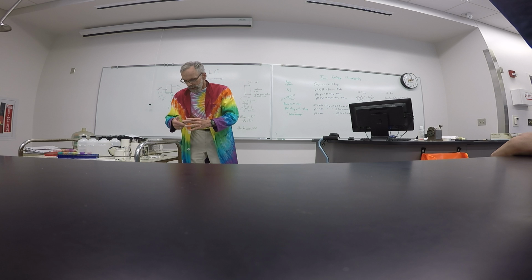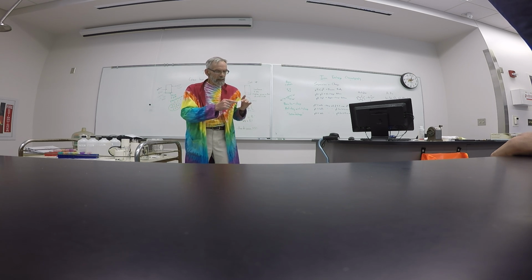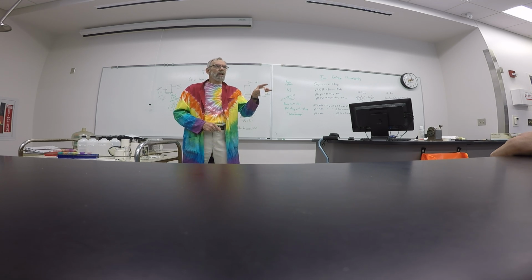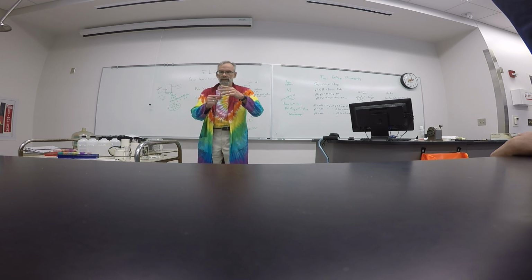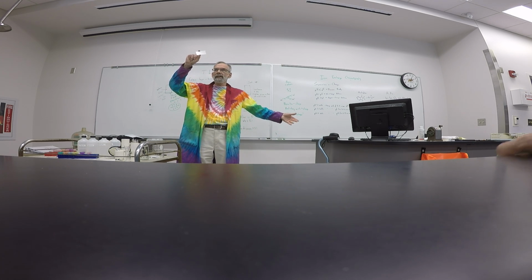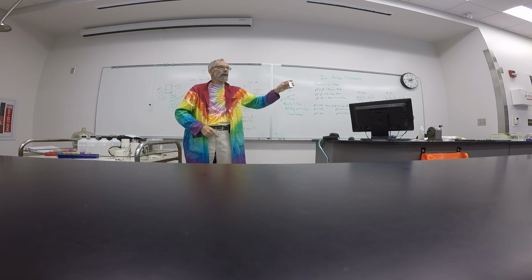Don't touch the gel. Now, I hand cut these, so some of them might be ragged at one end, or some of them might be ragged on one side. When you use this, if you've got a ragged end, put it up so there's no solvent and it doesn't touch any of your material. Okay, so this is what it looks like. The people who haven't done this before: the back is aluminum, it's not anything that we're working with, it's just a backing to make it solid. And the front is silica gel.